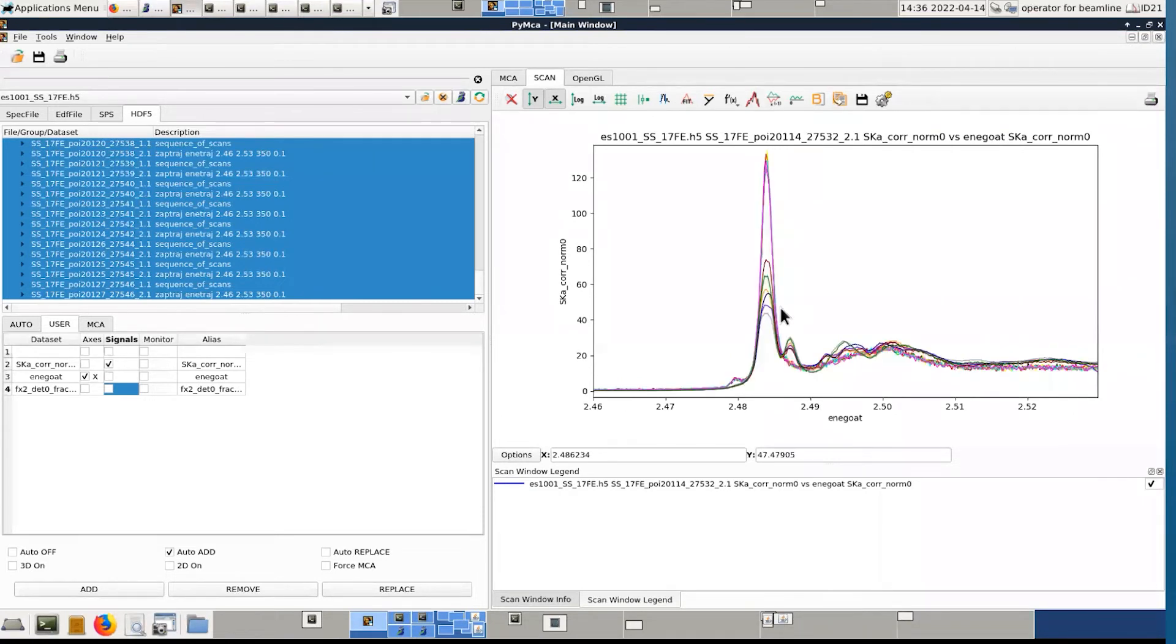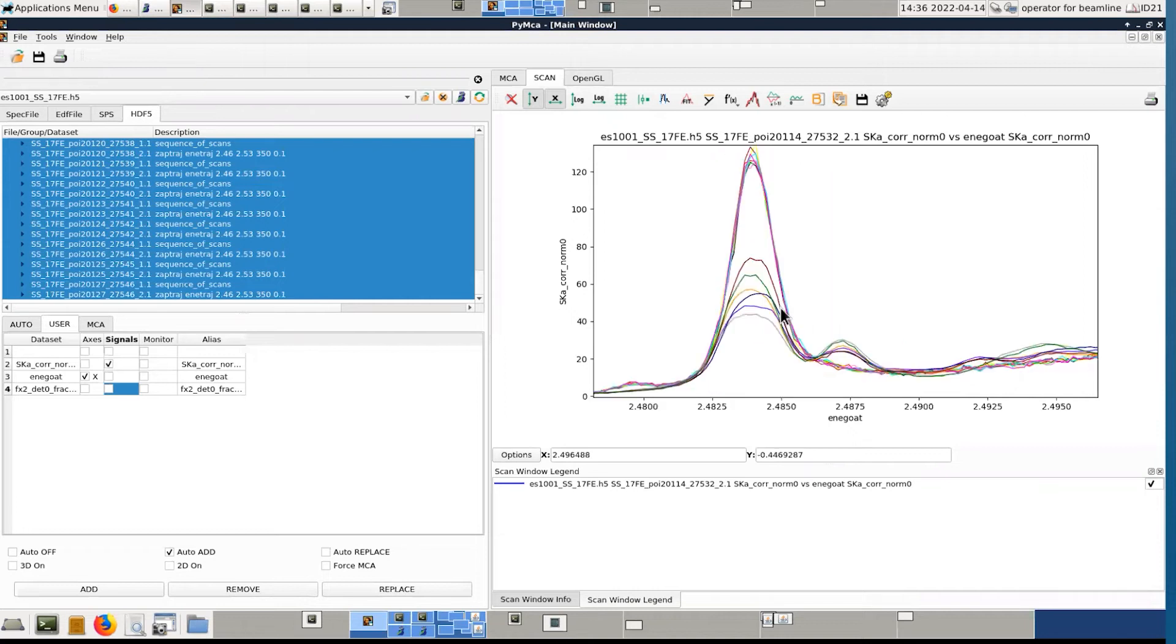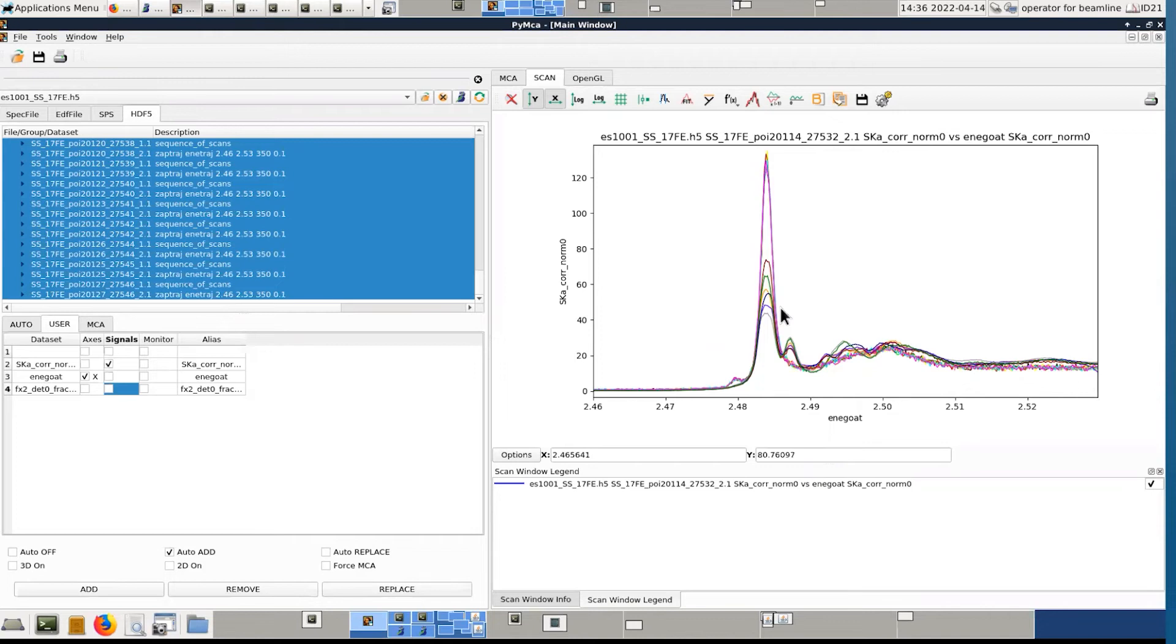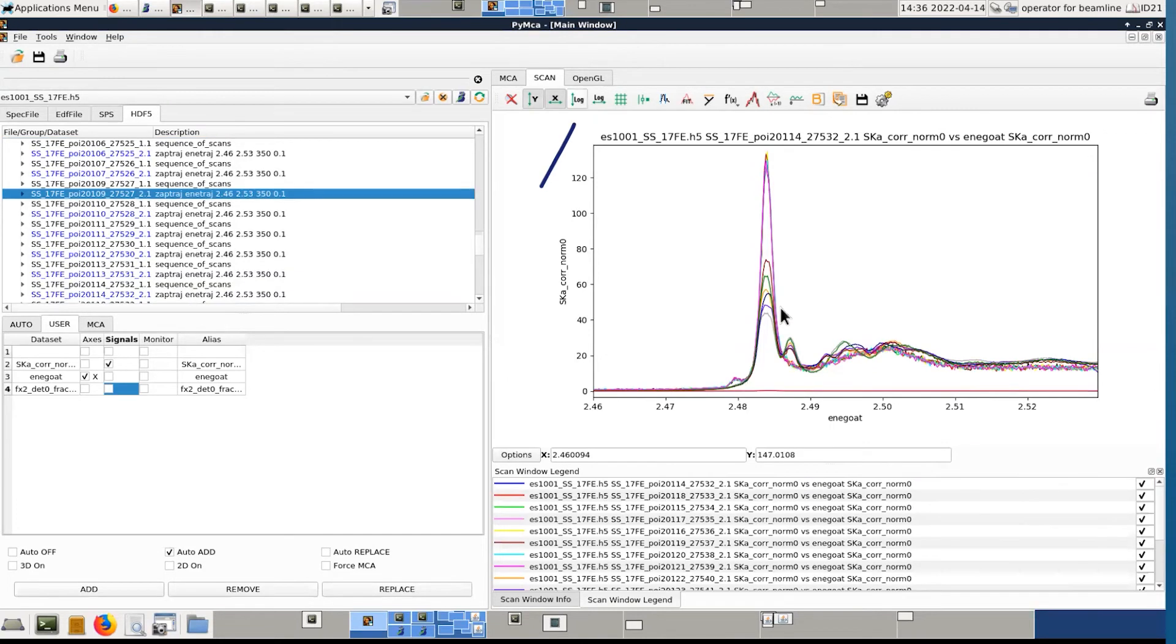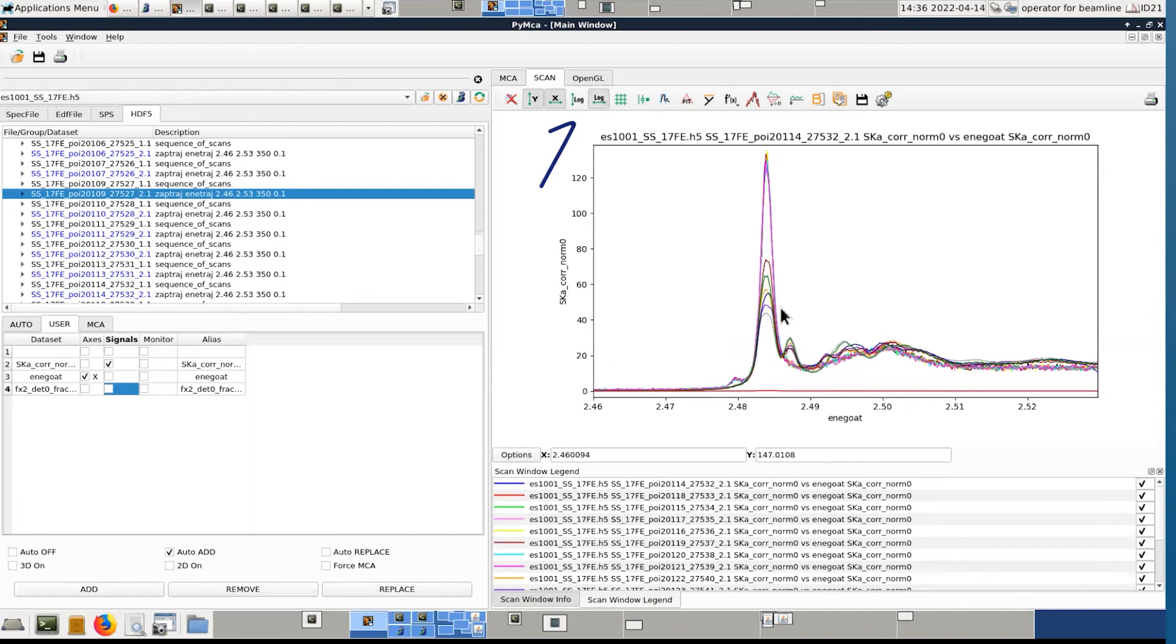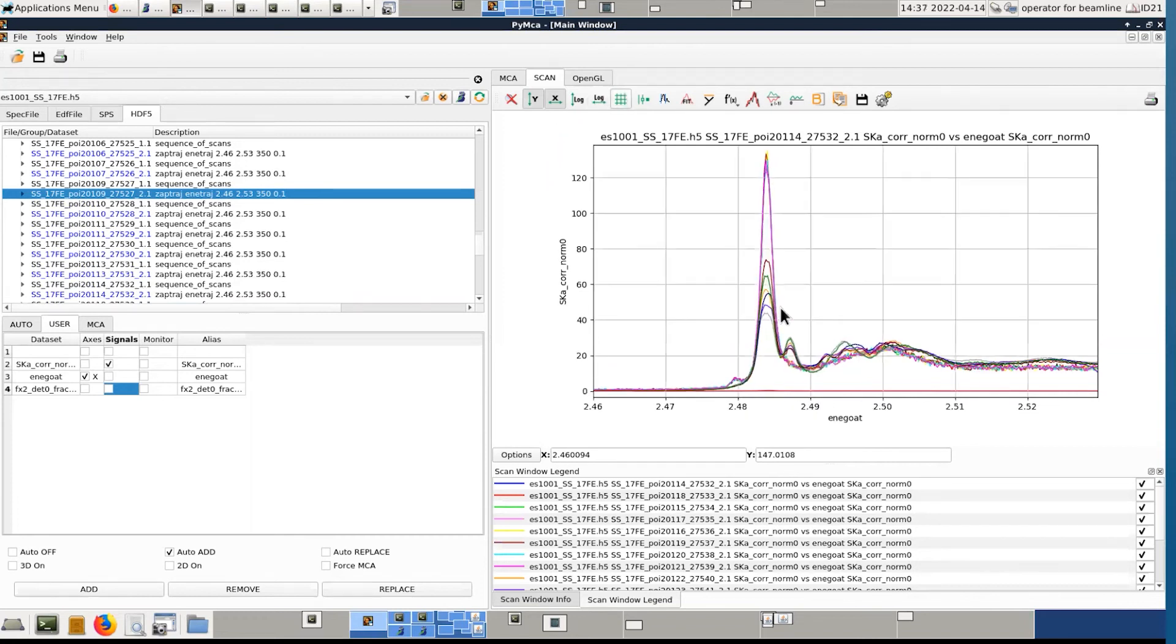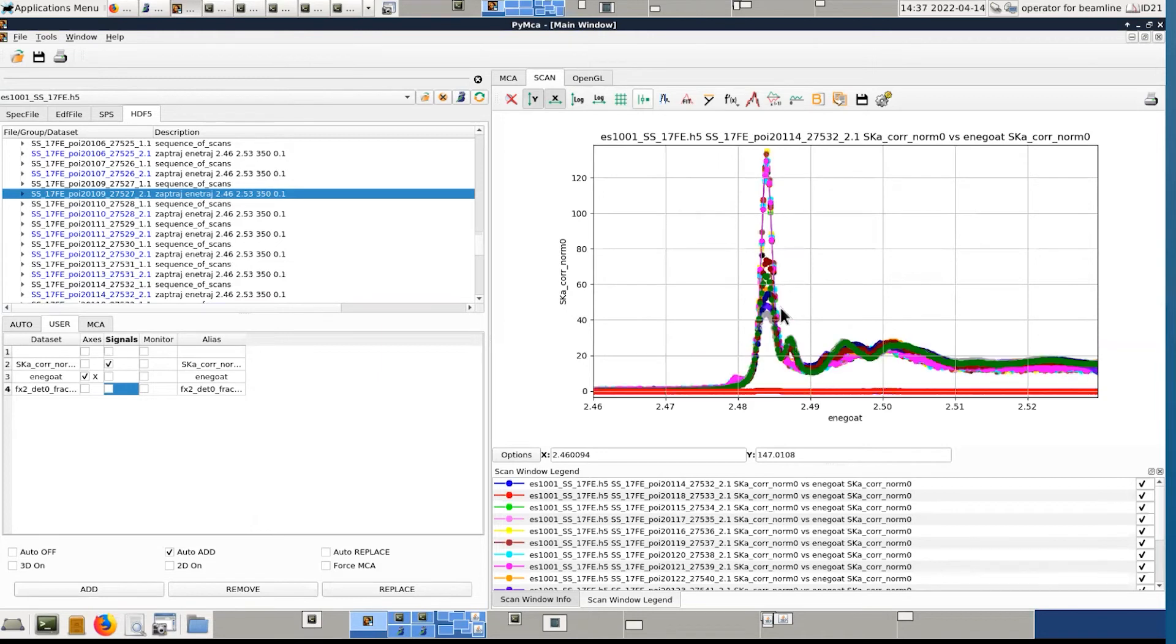So let's have a look at the different options which are offered in this scale bar. So if you want to zoom, you can zoom directly. And if you want to come back to the main field of view, you will click on the lens like this. Here you could switch to log scale in Y or in X. Here you can add a grid. Here this is to show points.